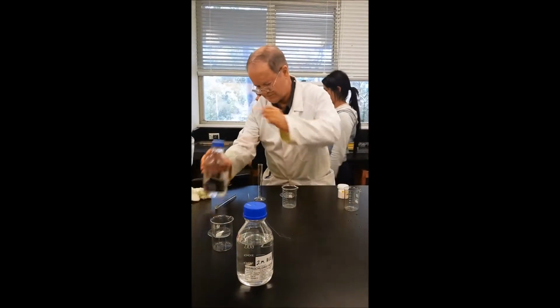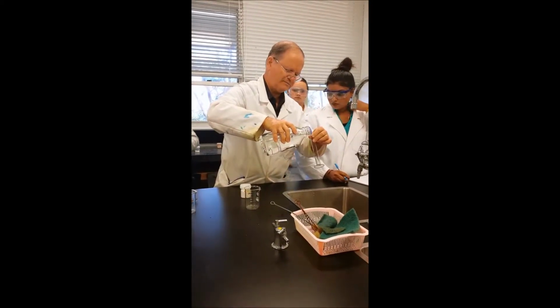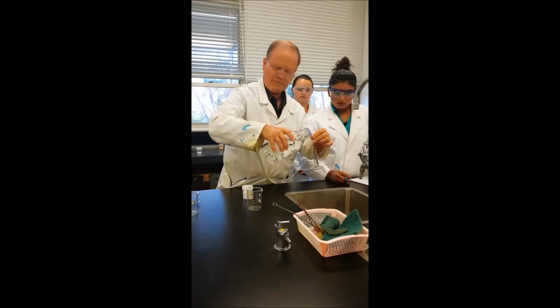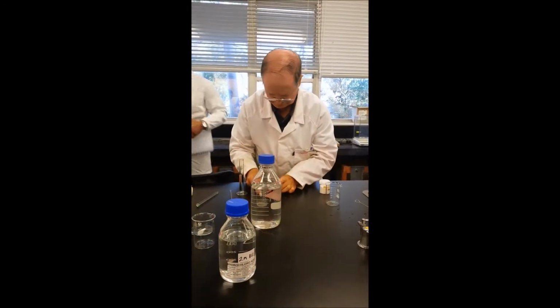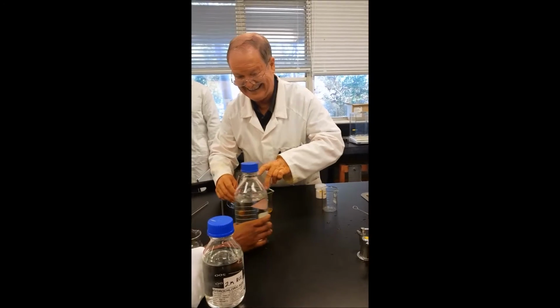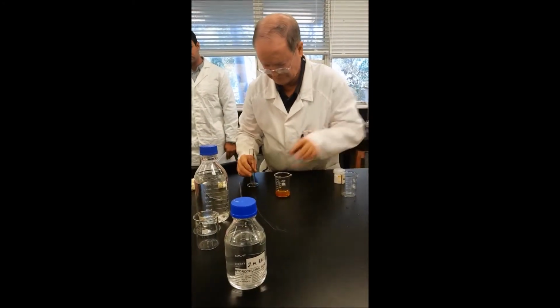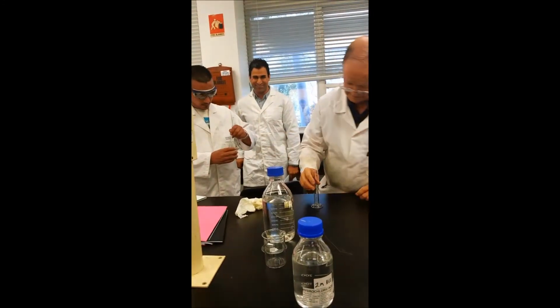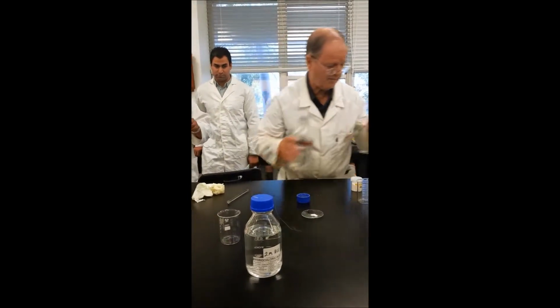Right, 20 mils will be it. Actually, we should use a beaker to measure this out. Pour it in and then, can you move the bottle? Yeah, right. Okay, there you go. Rinse it in. How can you stir this while you're looking at it? Okay, and this is for the phenolphthalein.